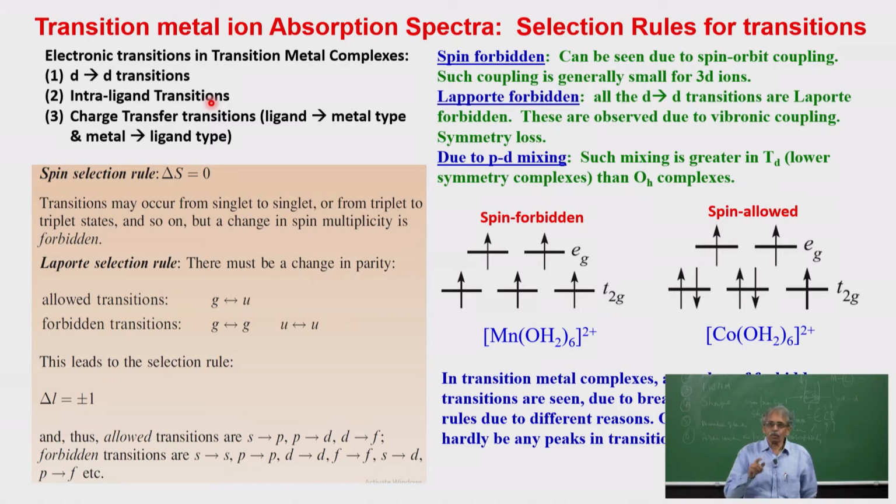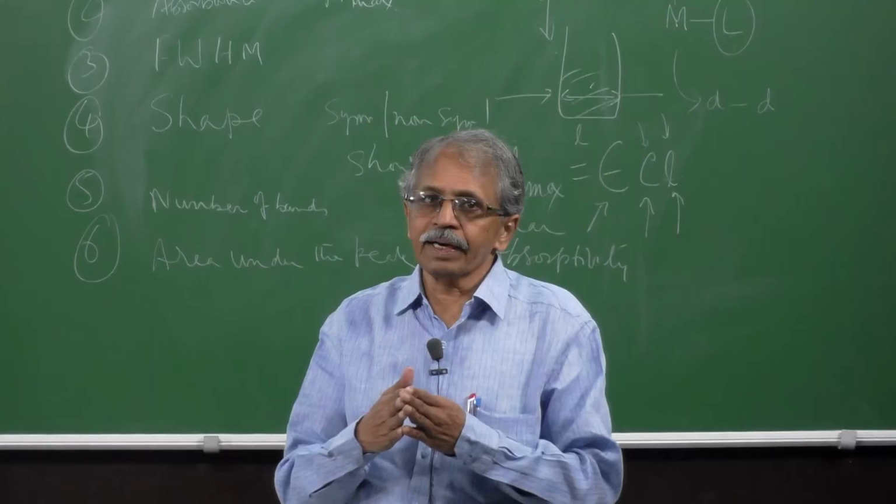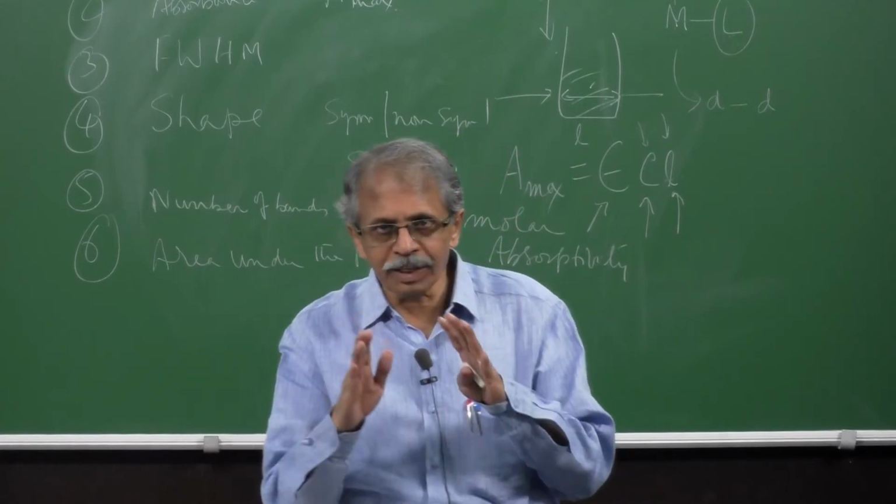And that is a good parameter, because from the shift, or the change in the width or the intensity, you can say that a particular ligand is bonded to the metal ion. So that is a good thing. If it were the same value, you would not be able to differentiate the bonded ligand versus the non-bonded ligand. I hope that is clear.